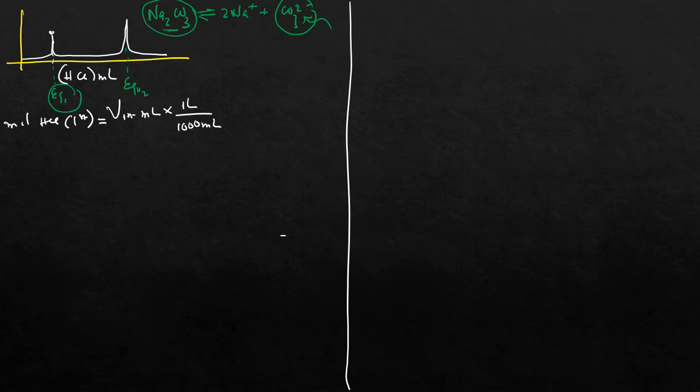You know the actual molarity of your HCl from your standardization experiment. So I'm going to use approximately 0.100 mole per liter. So this is just, for example, let me just use A moles.